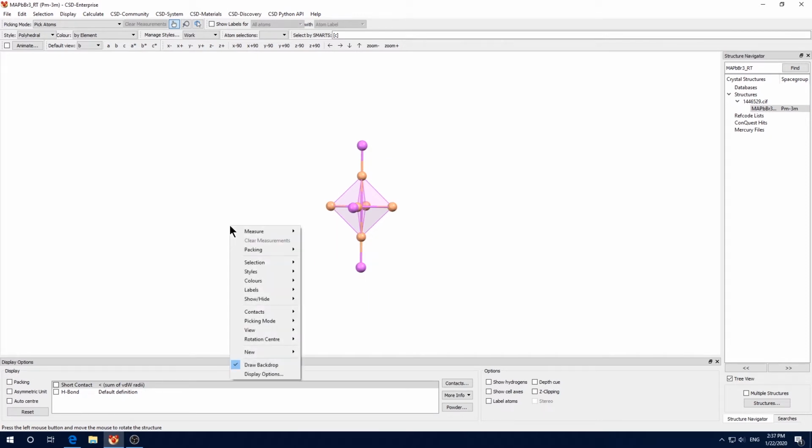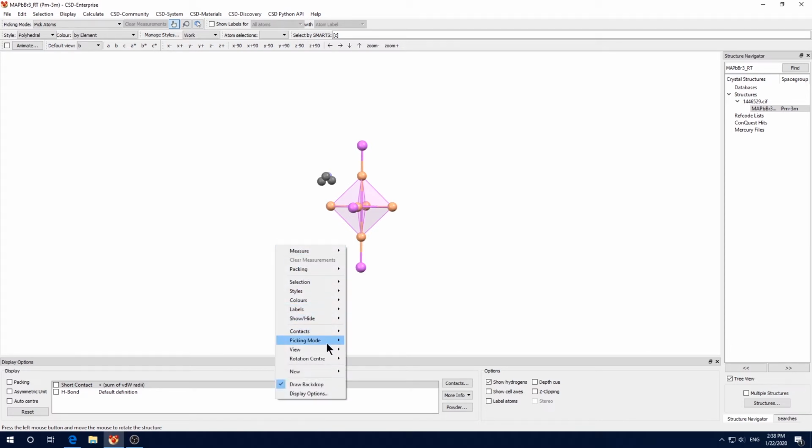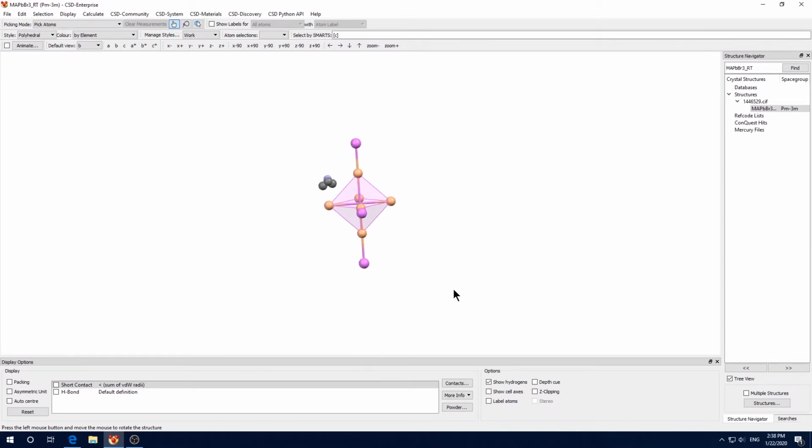Okay, by the way, when you open it up, you might see more atoms like this. So I actually hid a few atoms already. When you open it up, this is the chemical formula you will see. So if you don't want to see these carbon and nitrogen atoms, you just left click to select them one by one.